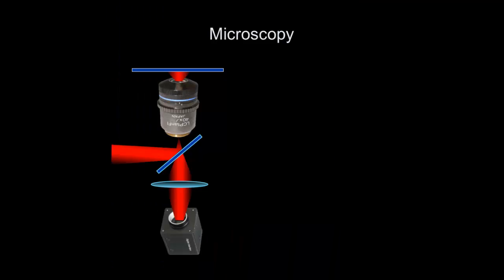Okay, so microscopy, what is a microscope? We all know what it is, I don't have to tell you that. But just to reset the button on this, that is the most important element of your microscope. Okay, that's right. So that is an objective lens. It does all the magic, okay? Because it basically allows you to take light in, illuminate a certain area, and then image that light, in this particular case, with a combination with an extra lens right here onto an image plane right there. You put a camera there and you can see the image that's taken, that's sitting right here.